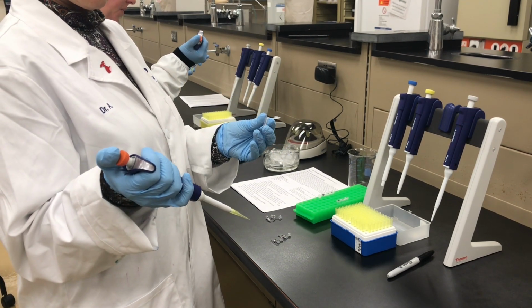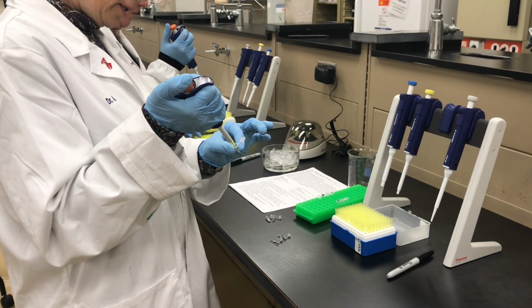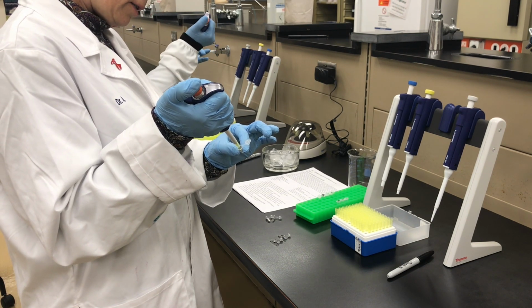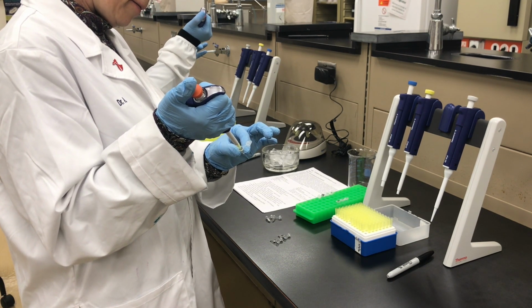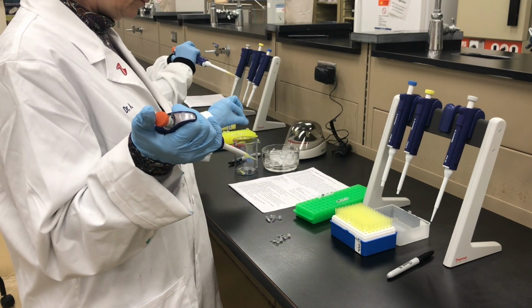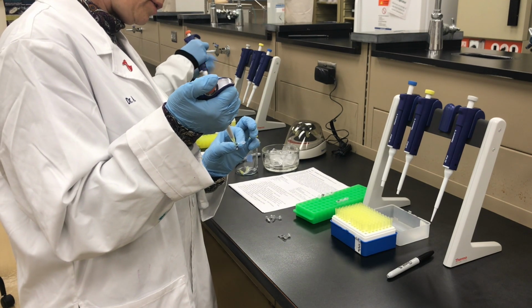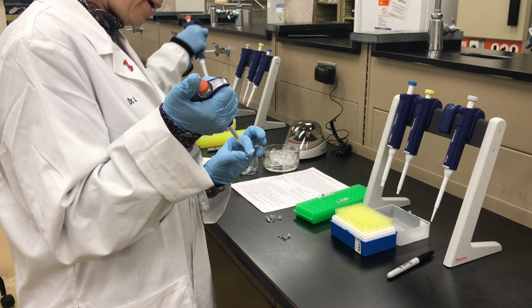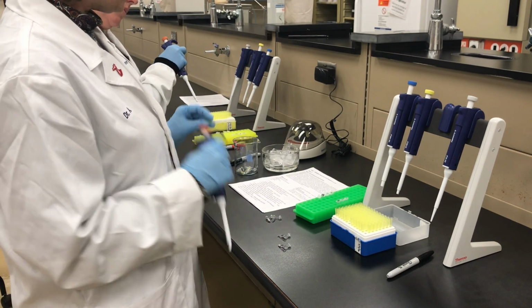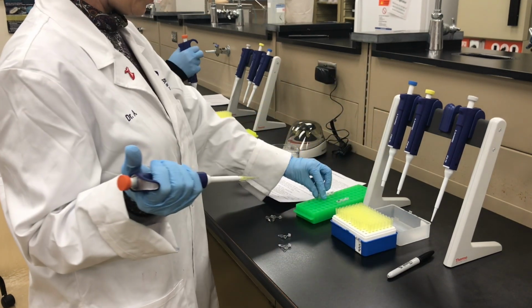I am going to depress to the first resistance, stick the tip in the water, release, and it sucks up the water. I'm now done with this tube. The tube goes in the trash, the water goes into tube number 1. And that white ball is magically going to disappear because it's dissolving in the water.